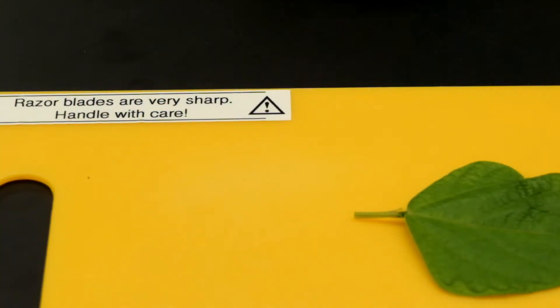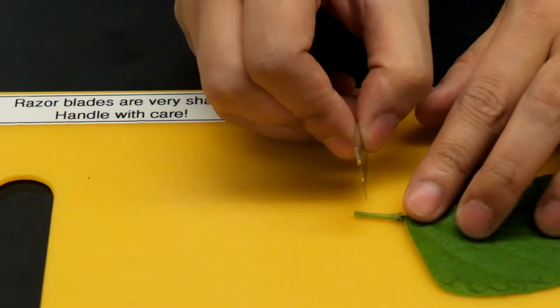Once you have selected your leaf we'll then use a razor blade to produce a clean cut on the stem.